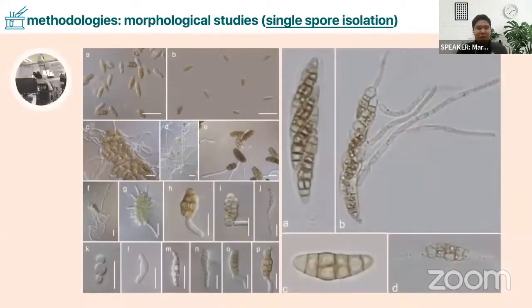Sorry, these are already germinated spores. You can see here the different germ tubes. Why are we taking pictures of germinated spores? This is very important when you want to see the pattern of where the germ tube arises. For example, this one arises from the basal part. Some of them arise at a different angle, and some at the polar, apical, and basal cell.